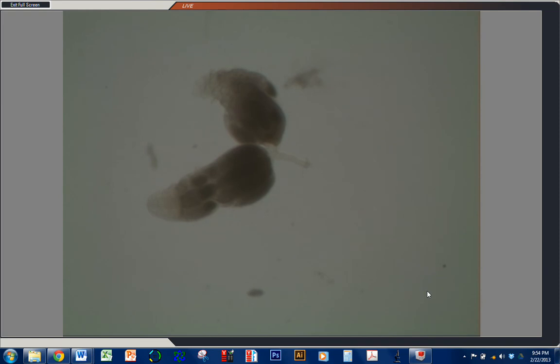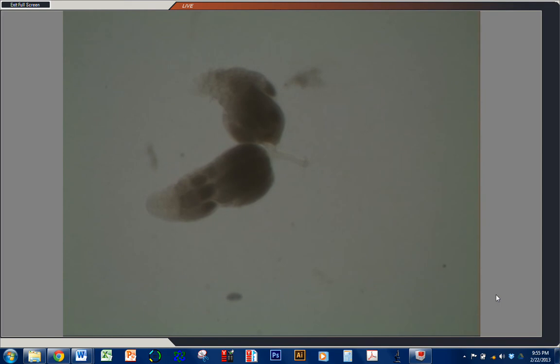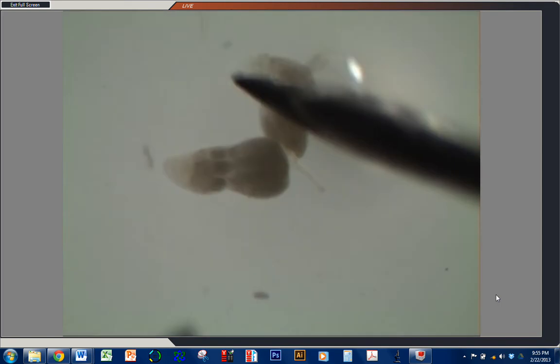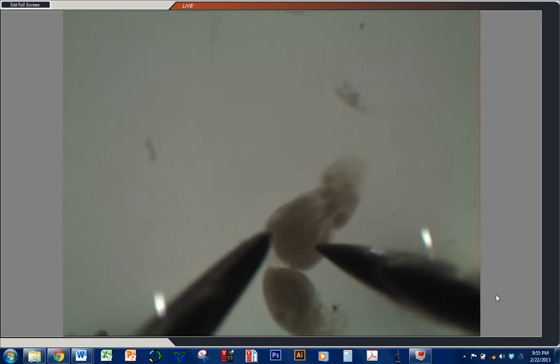So, before we can perform immunohistochemistry, we need to separate these ovarials into individual ovarials, as opposed to having them bundled together in the ovary. The problem with leaving them bundled together is that the antibodies that we're looking to treat these with won't be able to permeate the structure, and you'll get staining on the outside of the ovary and not in the interior.